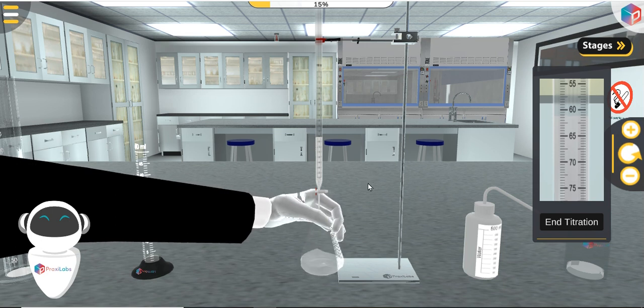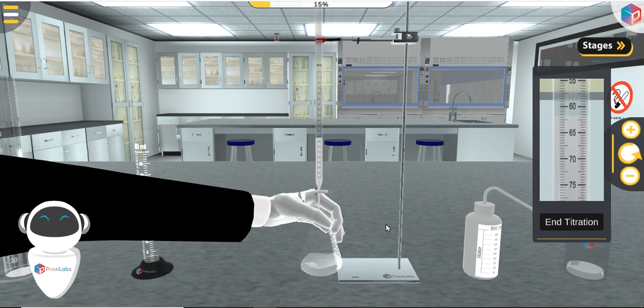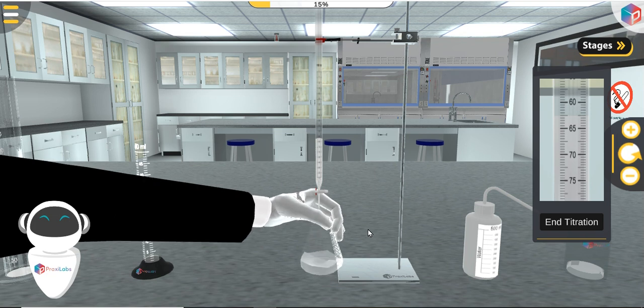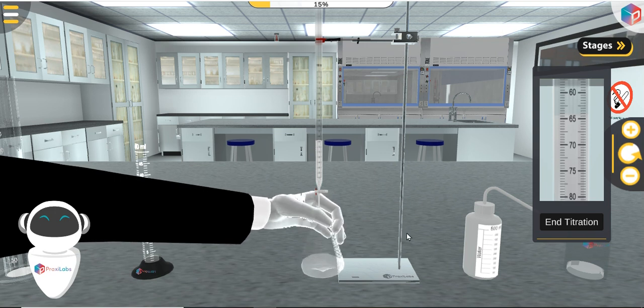There should be a noticeable color change. Or do I miss anything? No result is also a result. Remember, if I had made a mistake in this, no result is also a result as far as science is concerned. All right. I haven't noticed anything yet.